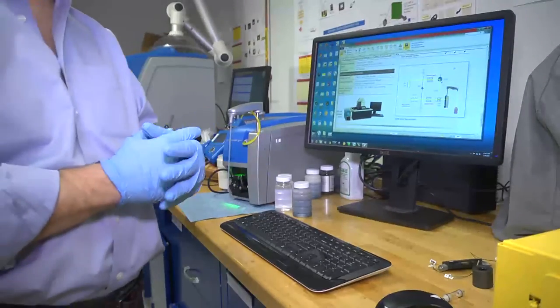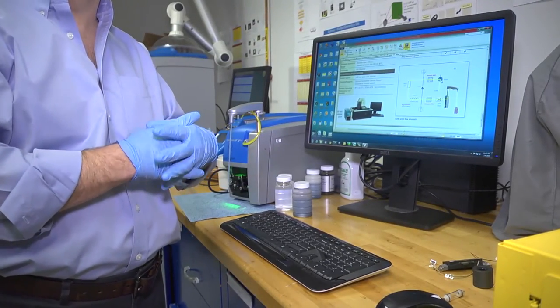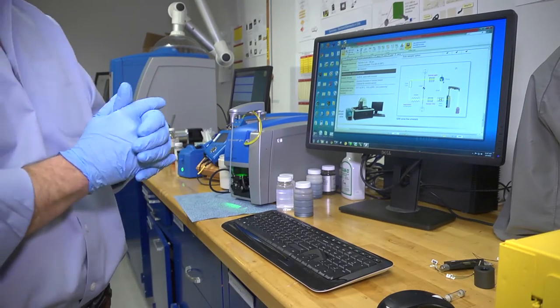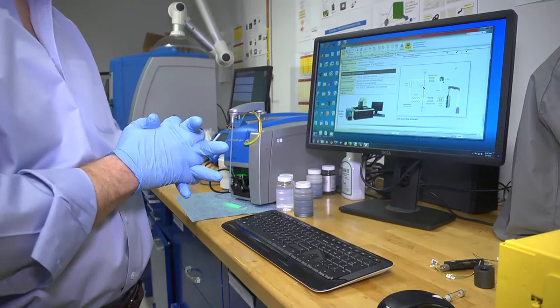Welcome. I'm going to give a brief demonstration of how to process a sample on the Spectro Q230 LaserNet Find particle counter, wear classifier and ferrous monitor.